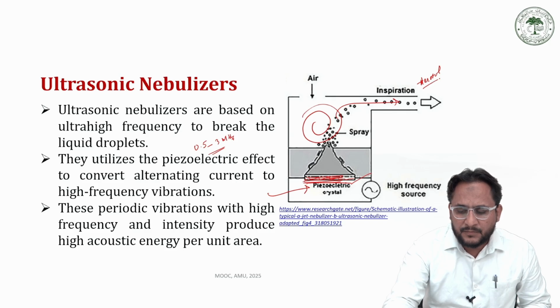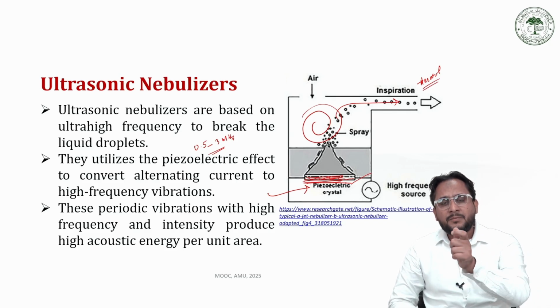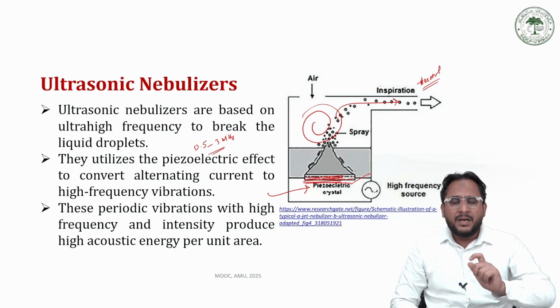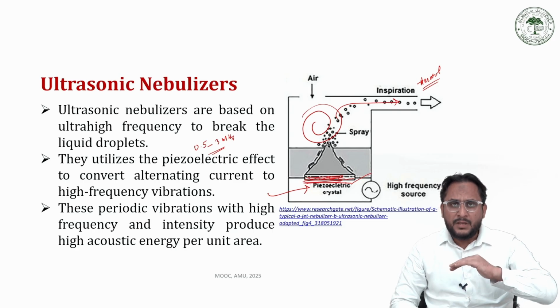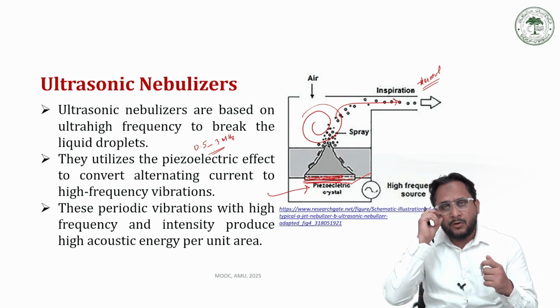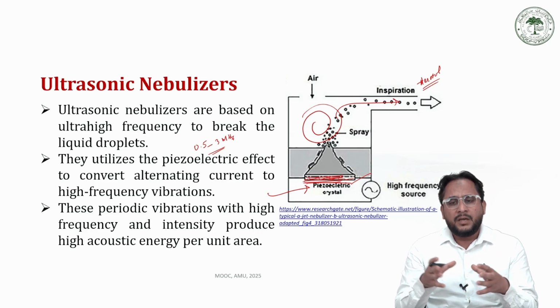So these ultrasonic nebulizers utilize the principle of piezoelectricity, where a piezoelectric crystal, upon receiving electric current, starts vibrating at very high frequency, and the impact of that crystal breaks the liquid sample into small droplets of uniform size, which are then mixed with air to form a mist or an aerosol.